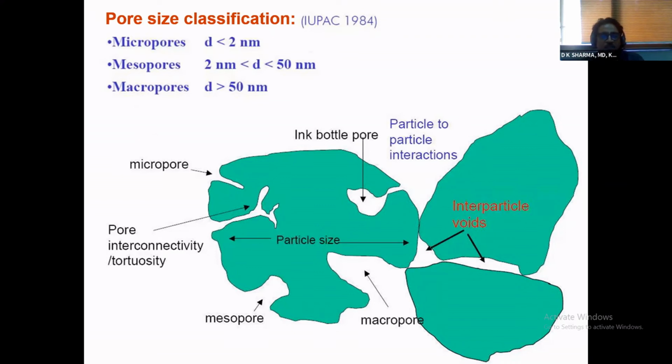It's not possible to create microporosity. There are methods, of course, by steaming and other things, but otherwise, mechanically, you can't create microporosity just like that. Microporosity has to come from the structure of the material. Mesoporosity comes from agglomeration of the non-porous particles. Okay, so this argument will be useful when I'm talking about something else after we see the results.